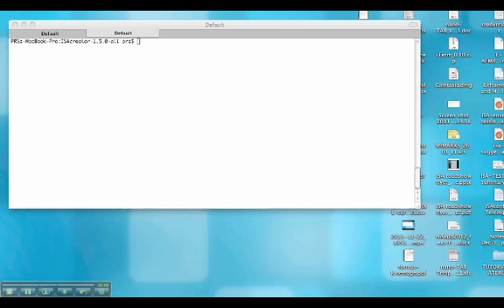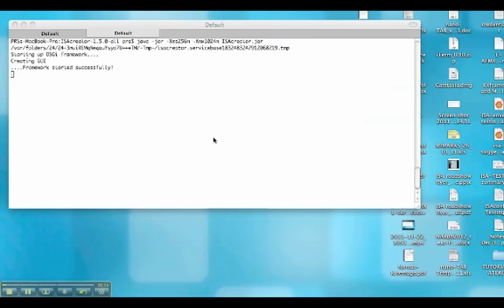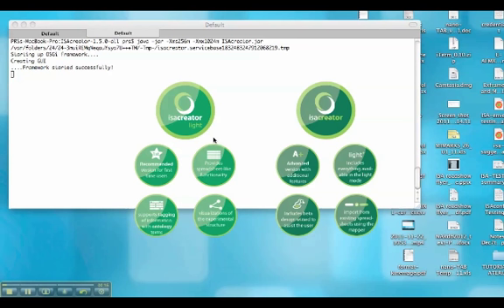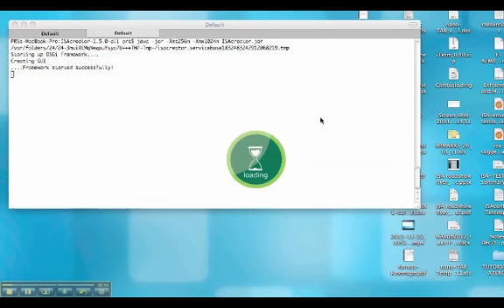Hello, we'll start a tutorial on ISAcreator, a spreadsheet editor to support the ISATAB format. Let's fire up the application. So you have to choose from two options: either a very light version or the more advanced version. The more advanced version contains elements such as the mapper, the wizard, and anything like this. That we will choose and select now to show you the full gamut of options available in the tool.